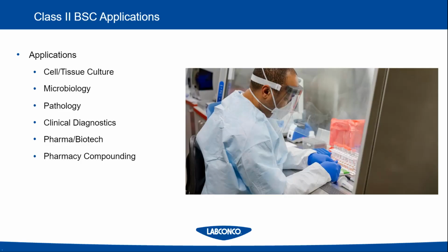Let's say a hospital has to mix up a sterile IV of medication to be injected into a patient. That could actually be mixed and compounded inside a biosafety cabinet to maintain sterility and protect the pharmacy technician from possible hazardous drugs.